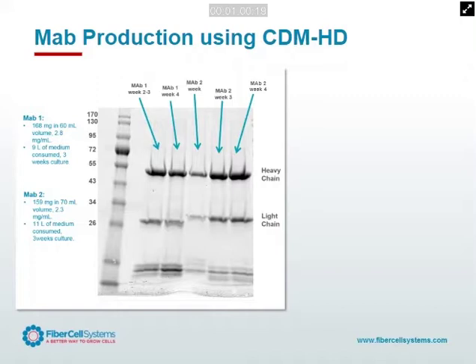So any method that doesn't incorporate the removal of TGF-beta from the hybridoma culture is not taking advantage of the fundamental biology that's involved with hybridomas. In this particular case, this is Aaron Bromage at the University of Amherst, and he's part of the National Veterinary Diagnostics Antibodies Consortium. And this is just kind of a general example.